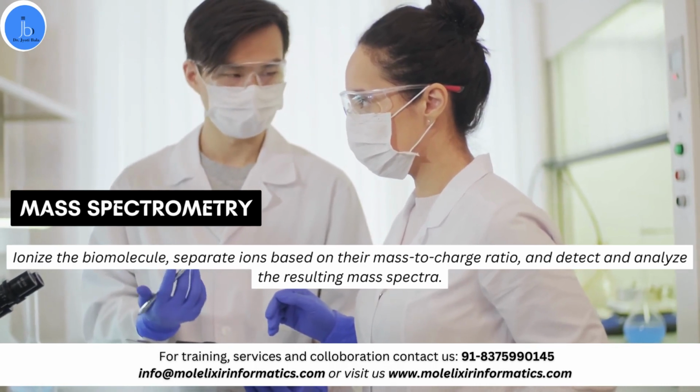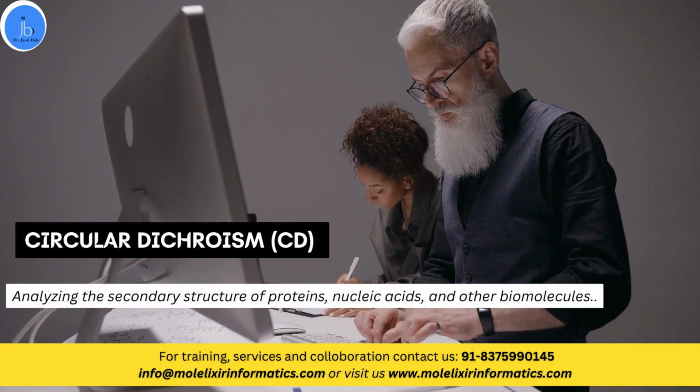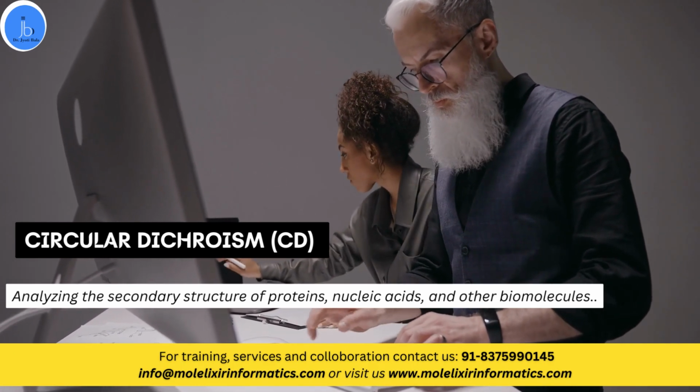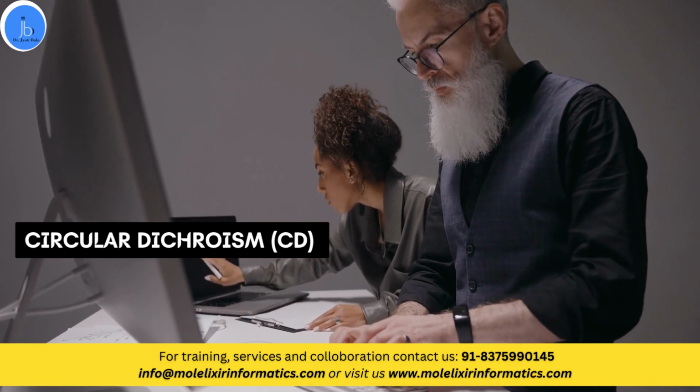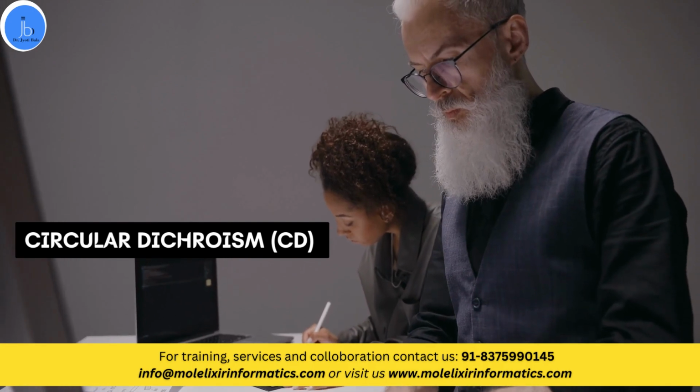The next one is circular dichroism. This analyzes the secondary structure of proteins, nucleic acids, and other biomolecules. This usually measures the differential absorption of left and right circularly polarized light to determine the secondary structure content.